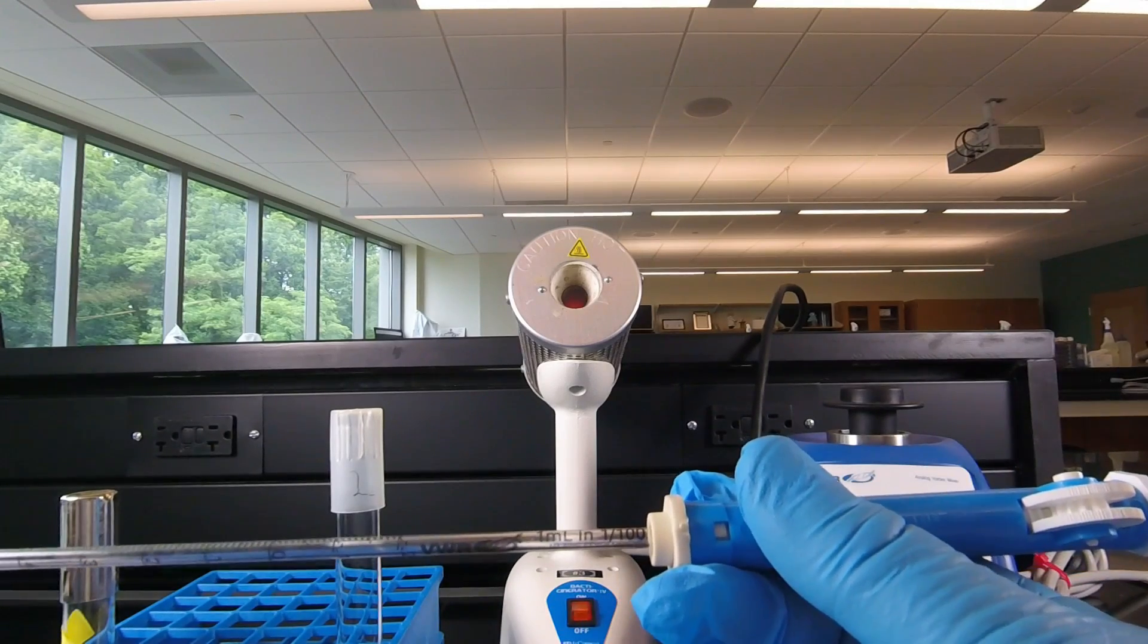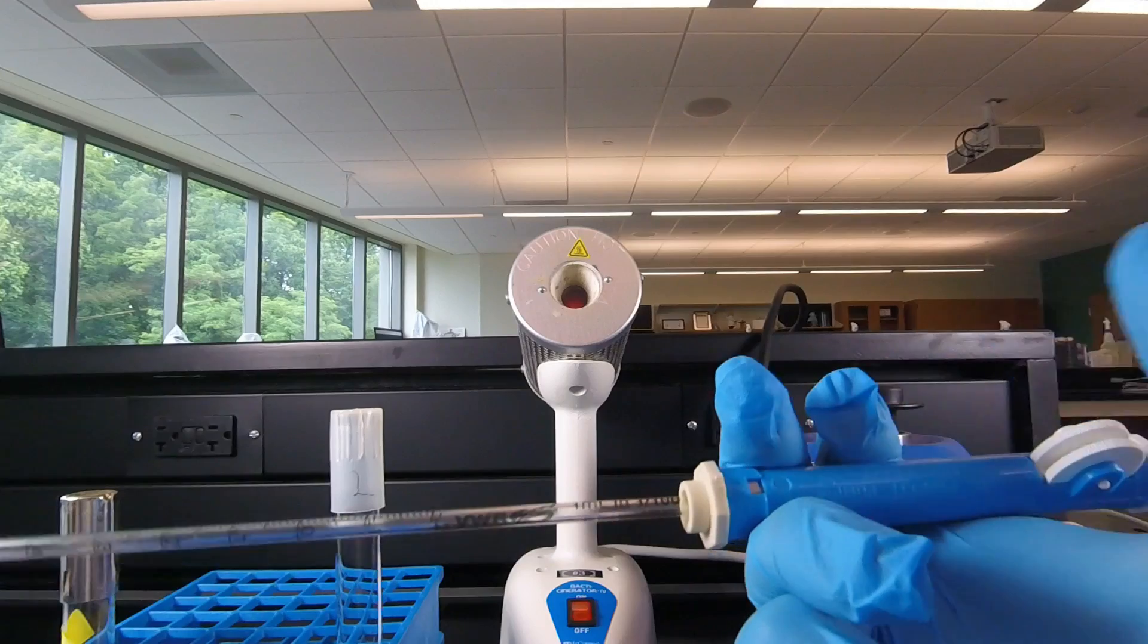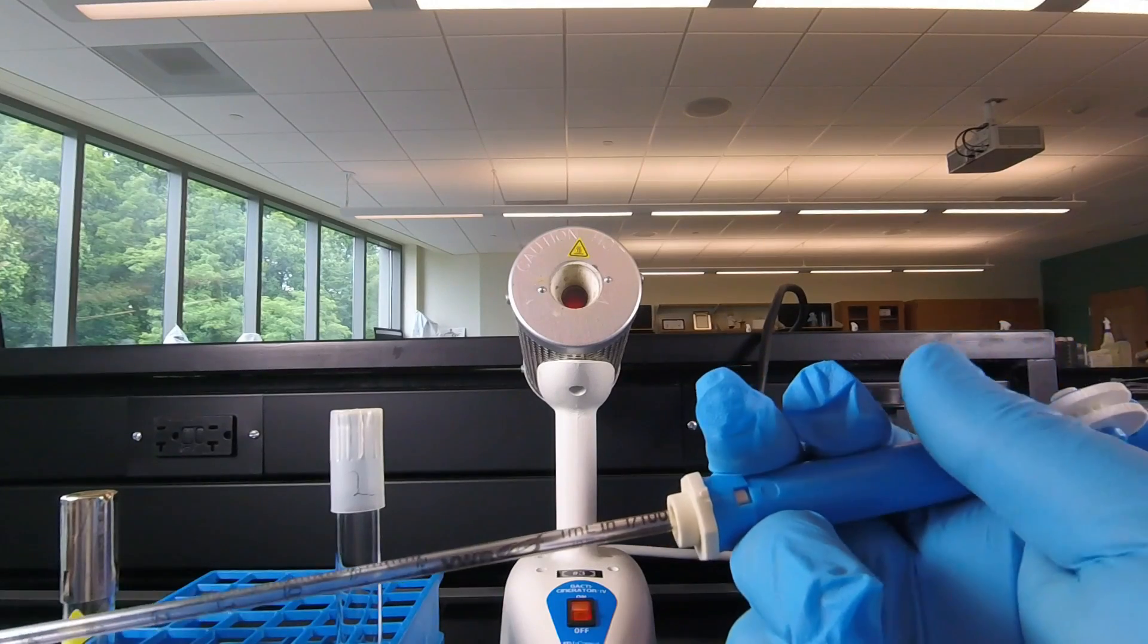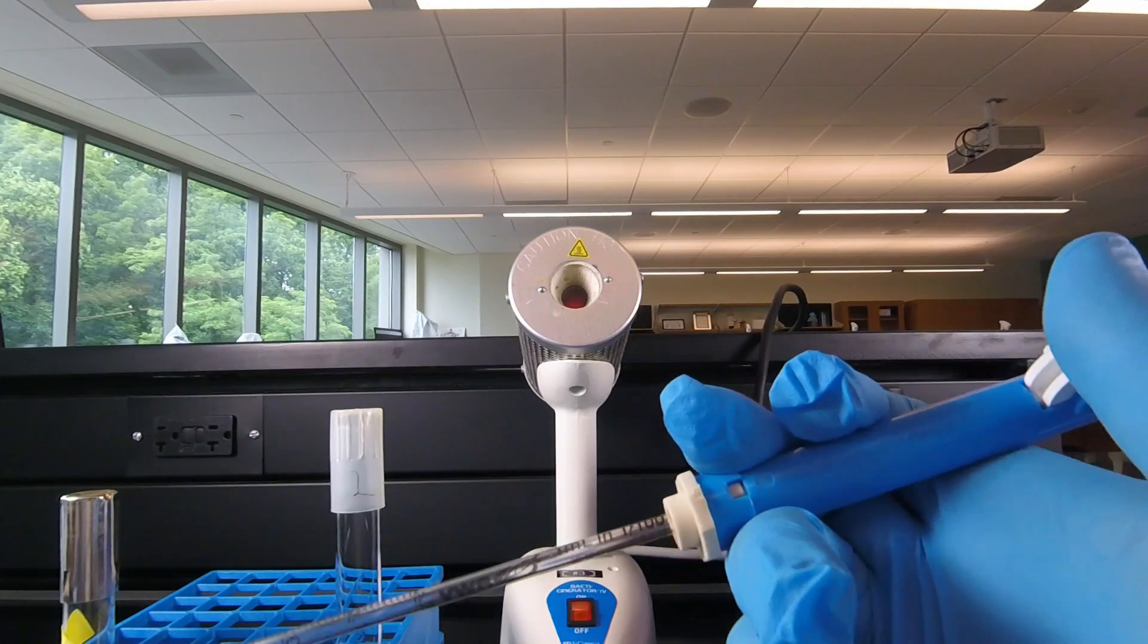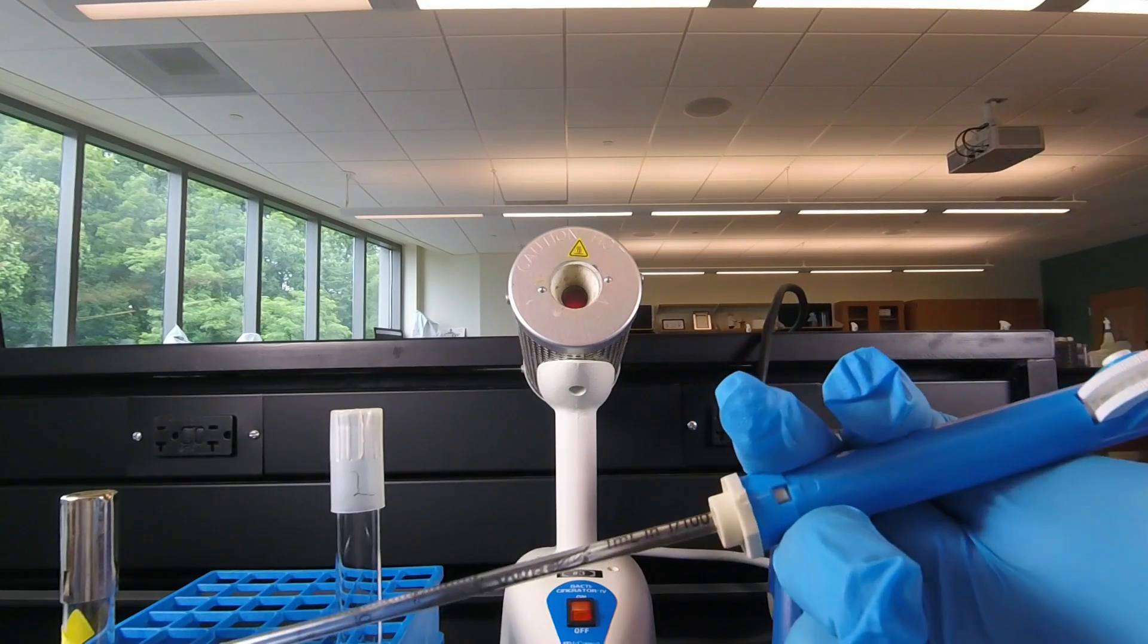...the one we use for a one mill pipet, and remember when you turn the knob towards you that's going to suck the liquid up, and when you push the knob up like that, that's going to dispense it.